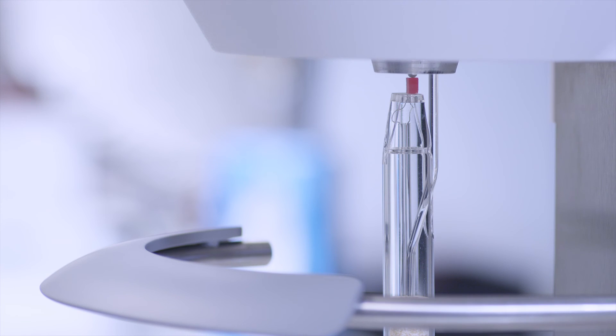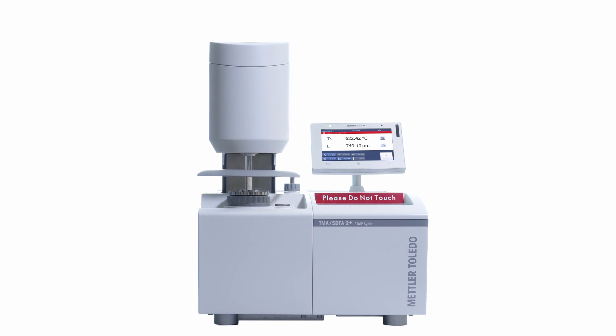Innovative technology, versatile modularity, and Swiss quality. Thermal analysis excellence premium offers outstanding measurement performance thanks to Swiss precision mechanics.